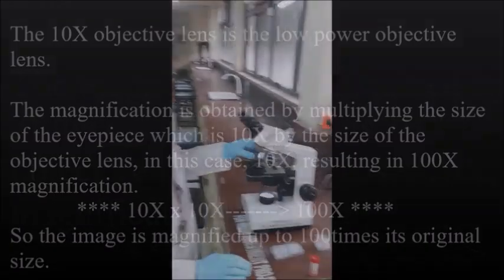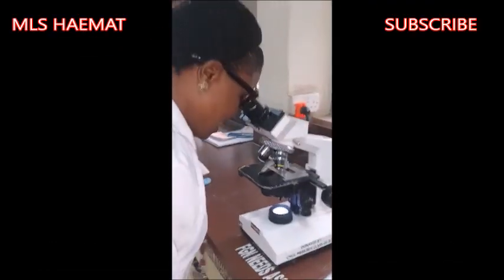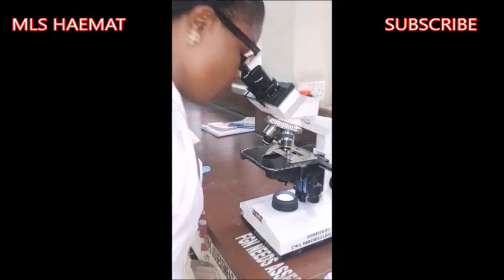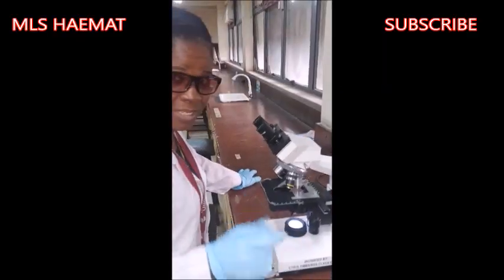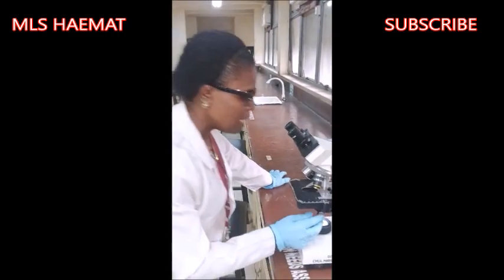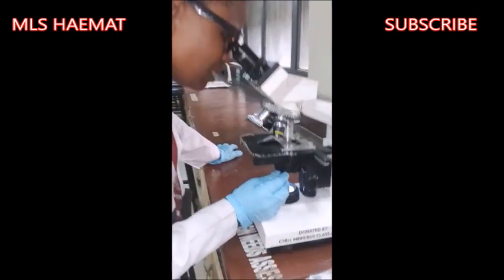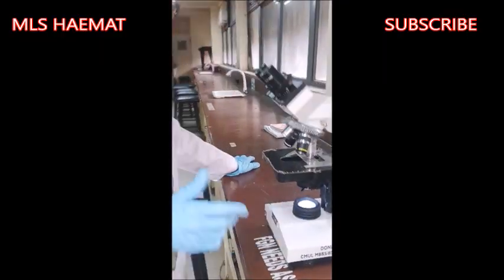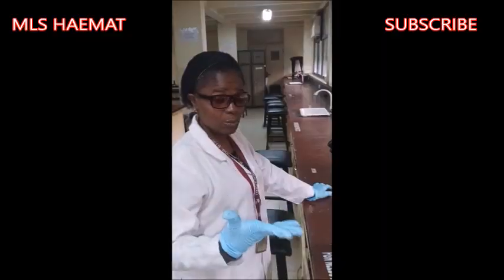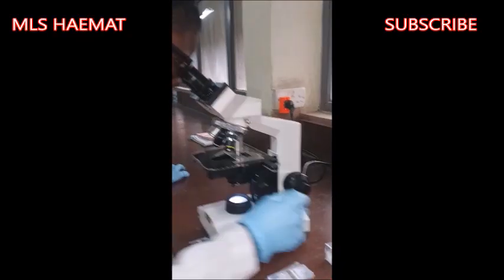And now I'm going to the times 40 objective. The same thing I did, what I'm going to do with this times 40 objective lens, as I looked into it, it's a little bit dark. So what I'm going to do is to just open the iris diaphragm a little, not completely. If you open it completely, that will be too much. Just open it a little for more light to enter.